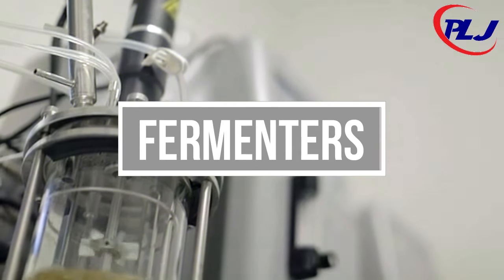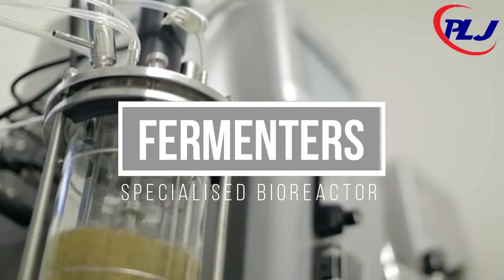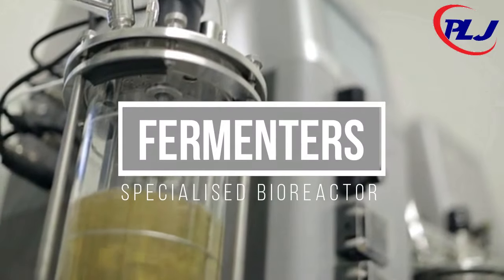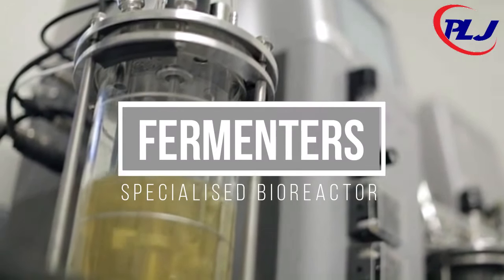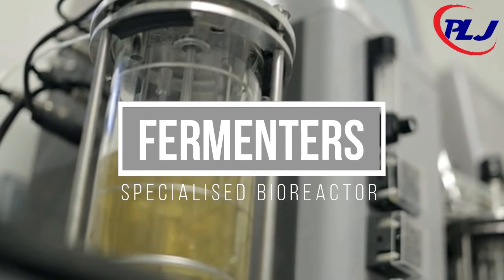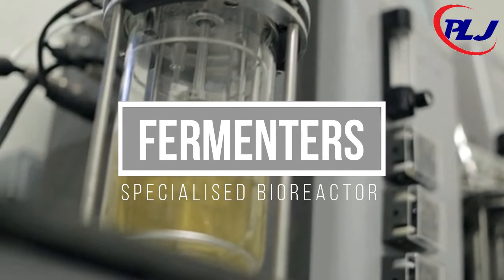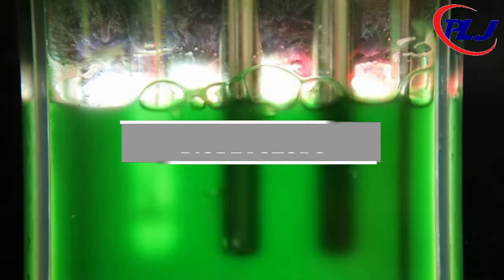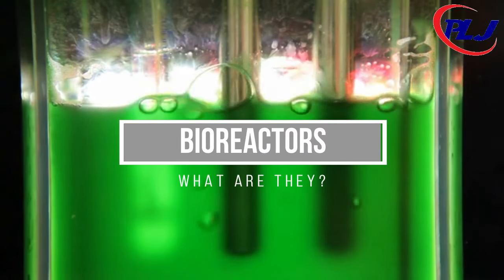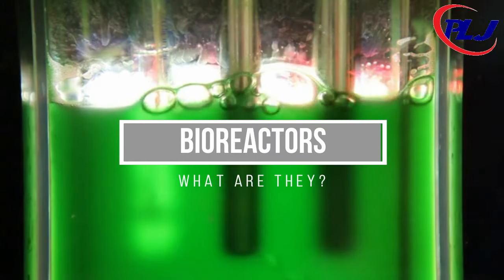Industrial fermentation is the intentional use of fermentation by microorganisms such as bacteria and fungi, as well as eukaryotic cells and insect cells, to make products useful to humans. Fermentation at an industrial level is carried out in specifically designed vessels called fermenters or bioreactors.